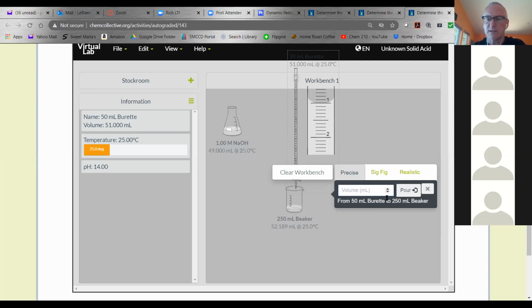So let's try to remember, how much should I add? Was there an estimate of how much to add? I think it was around 15 or something, 15 mils. Okay. I'm going to add 10 and just make sure. So 10.00. Pour it in.